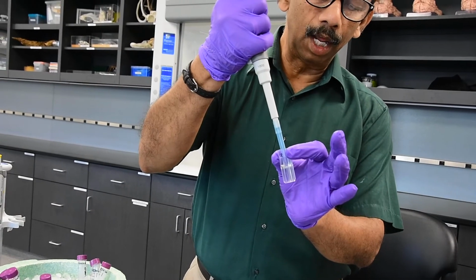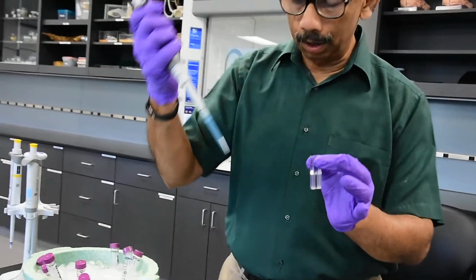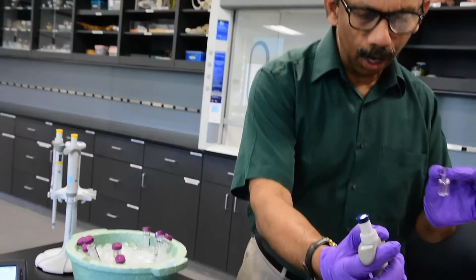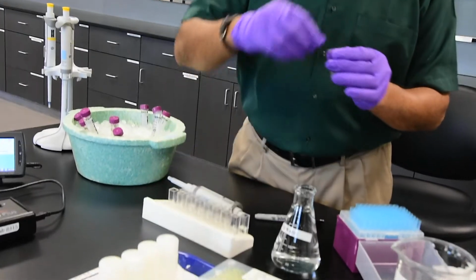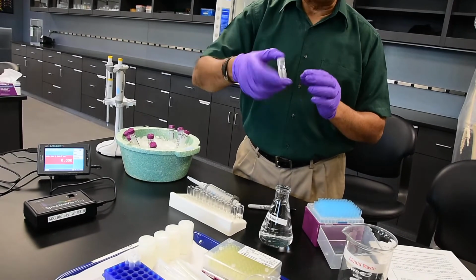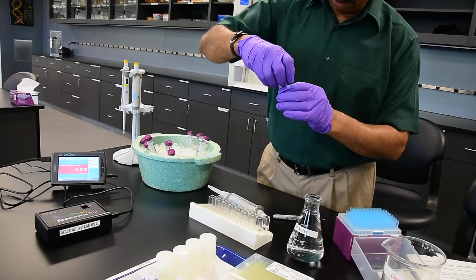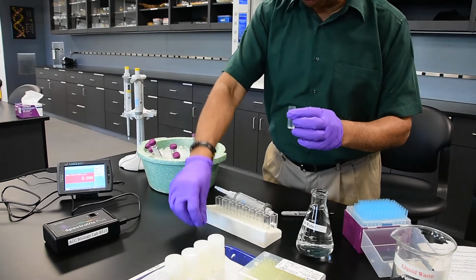See, I can do this type of mixing also. It gives an even mix, or you can also close these cuvettes like we did before, and you can also invert this upside down and mix it. There are 2 ways you can do that. And the other method I said is through, because this gets very tight, but you can remove that.